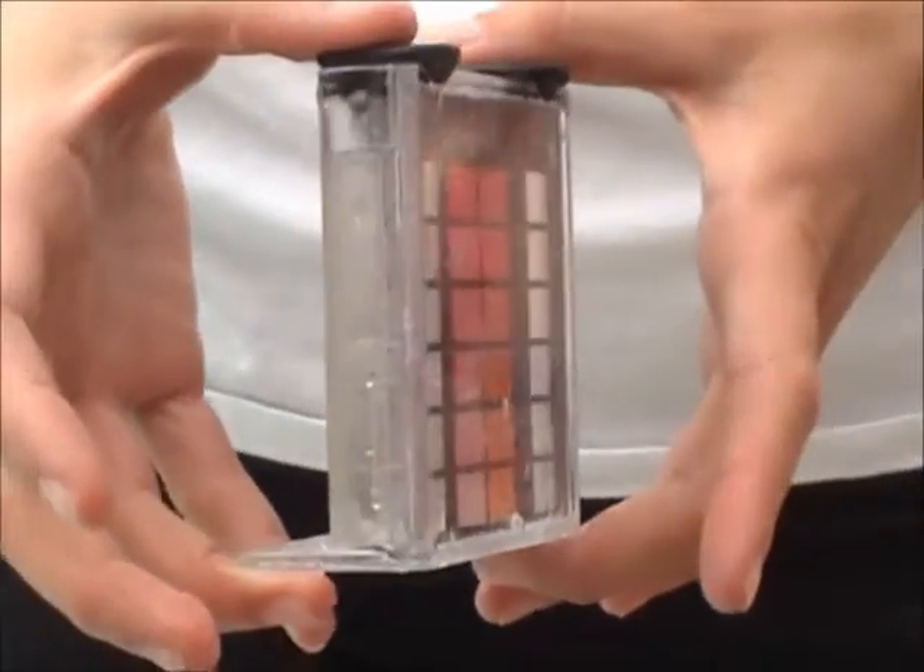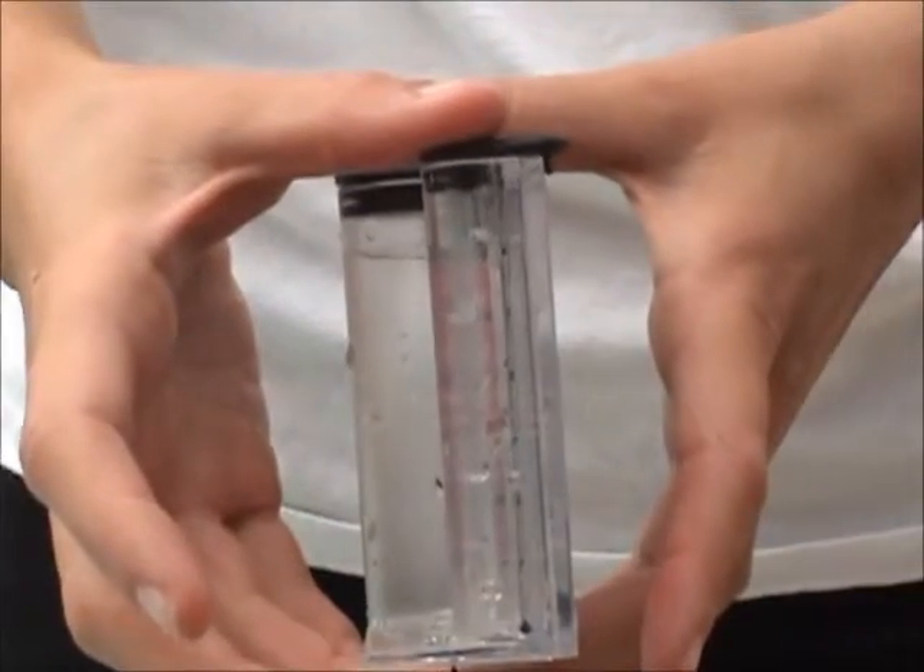The water in the comparator block should reach the designated marking lines on each side of the tubes.